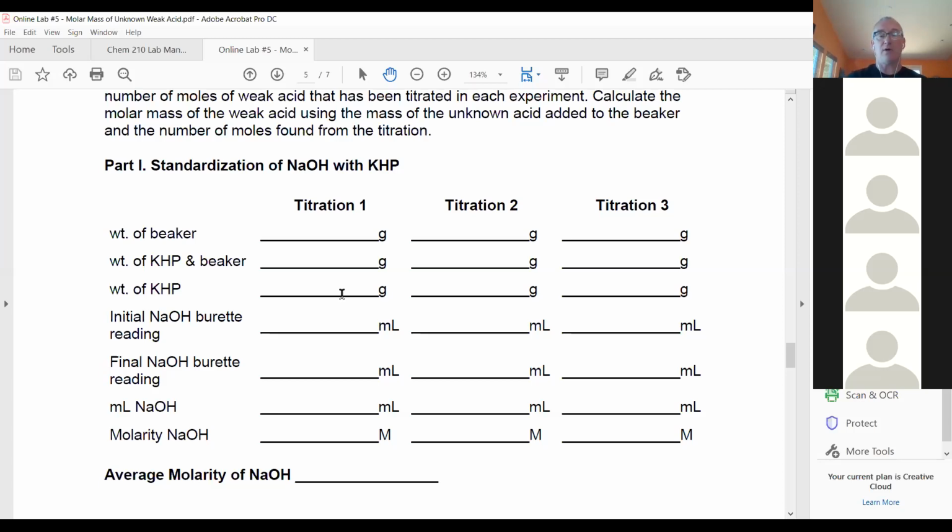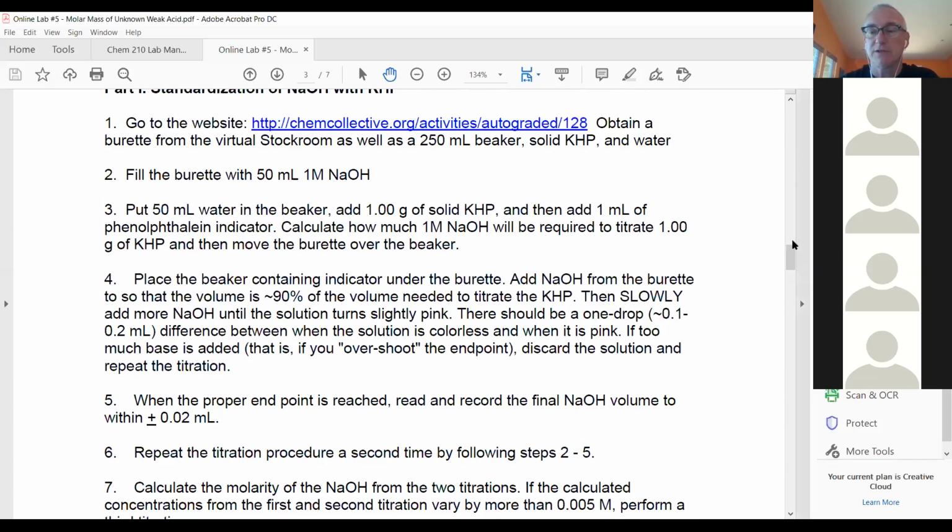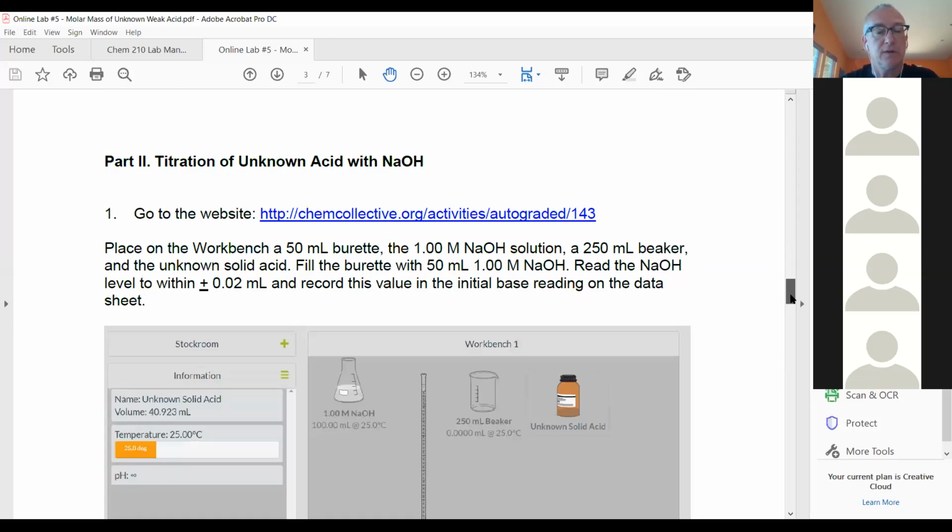All right, shall we try the second one? We're running out of time. Let's try the second one. So you basically do that one 3 times. That'll give you an average. So let's go to the second experiment. So I'm just going to click on that one. And new share.